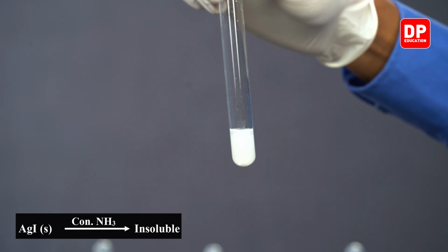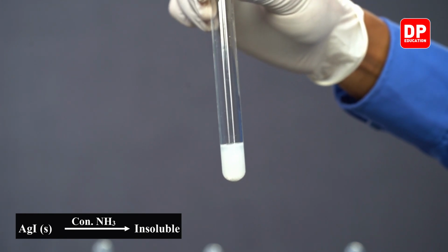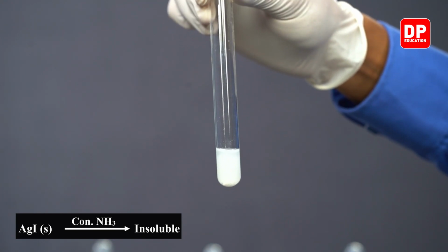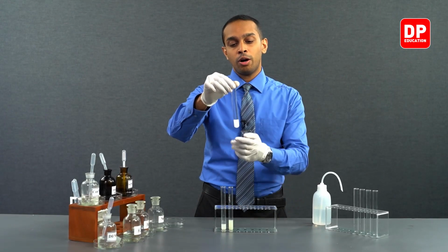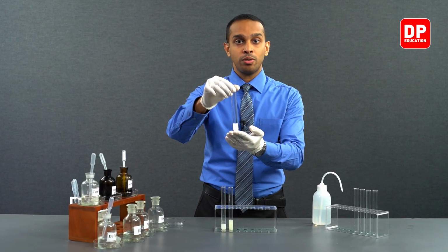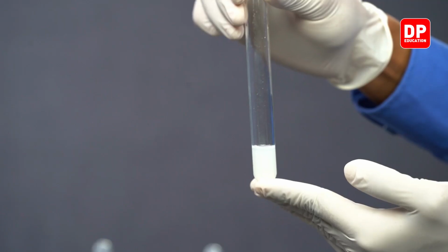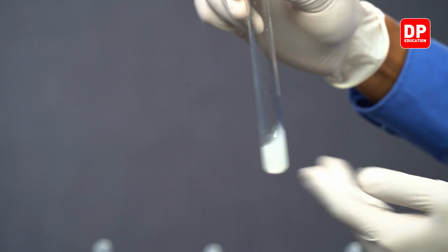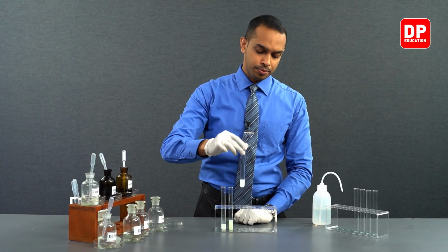This is because concentrated ammonia as well as dilute ammonia cannot dissolve the silver iodide precipitate that is formed. No matter how long you keep it aside for the reaction to take place, you will see that the reaction will not take place, as concentrated ammonia cannot dissolve silver iodide.